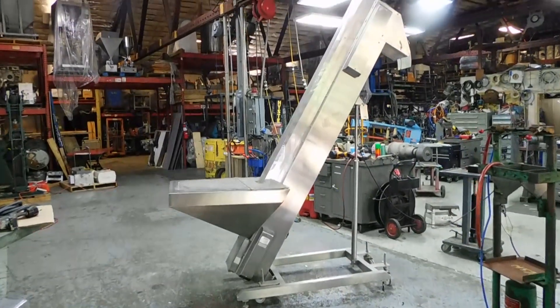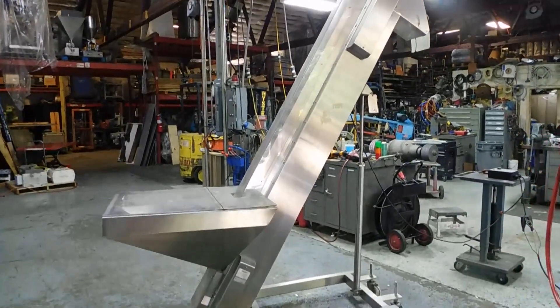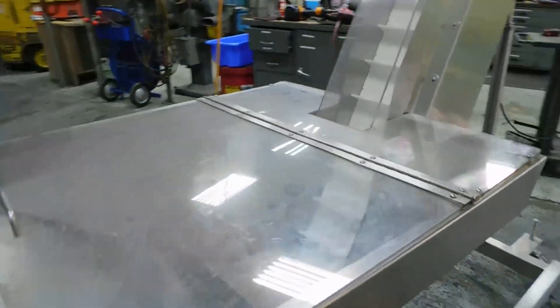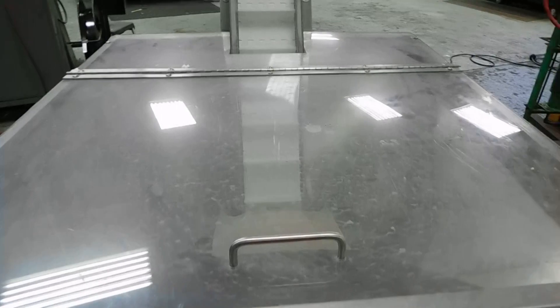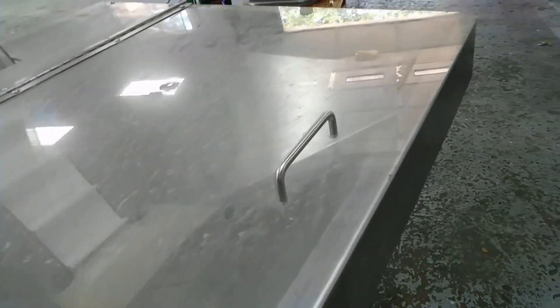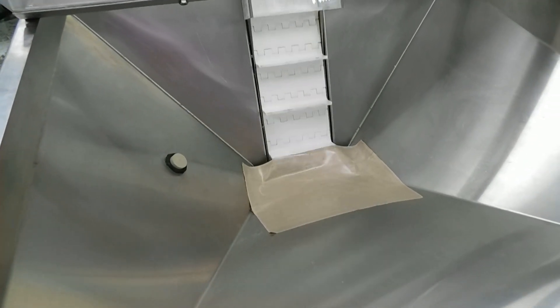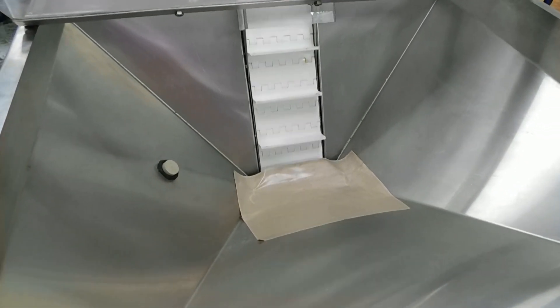Hi everybody, welcome again to Champion Trading. What we're showing you is made by DT Kalish — it's an all stainless steel pharmaceutical grade conveyor elevator, or a small lift. It has a beautiful polished finish.